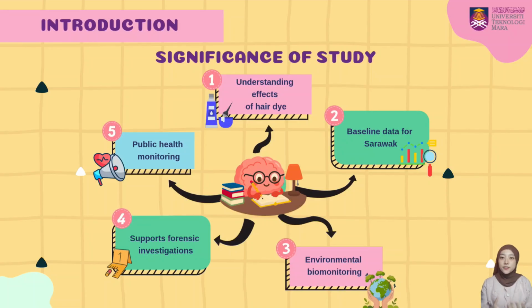This study is significant because it improves our understanding of how hair dye influences heavy metal accumulation. The findings also contribute to providing baseline data on heavy metal exposure among the Sarawak population, environmental biomonitoring, and support forensic investigation. Additionally, the study may contribute to public health awareness regarding the safe use of cosmetic hair products.